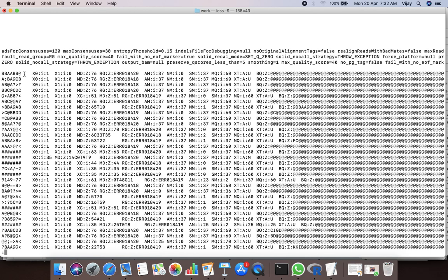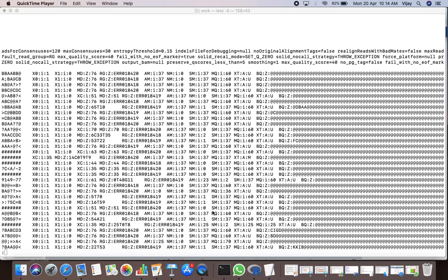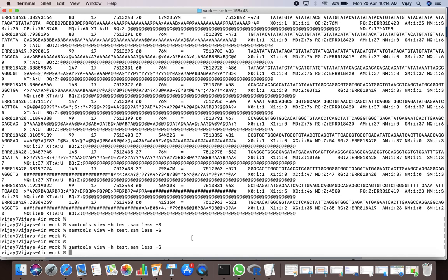In the alignment section, there can be additional optional columns which may or may not be present in a SAM file. To get back to the Linux terminal prompt, you have to press the Q key on the keyboard, and it will take you back to the Linux terminal prompt.